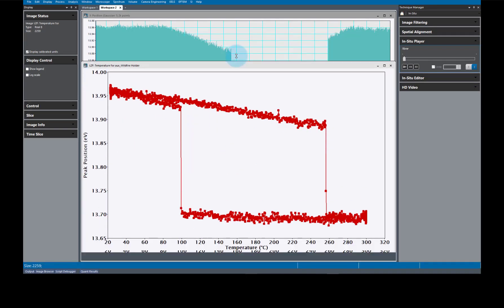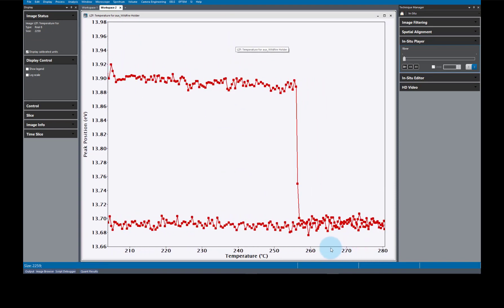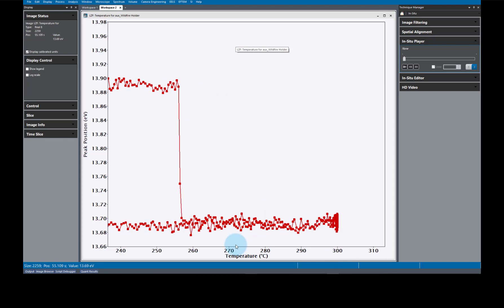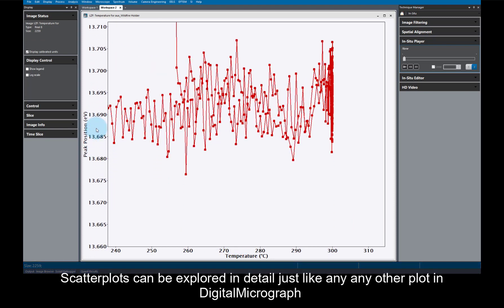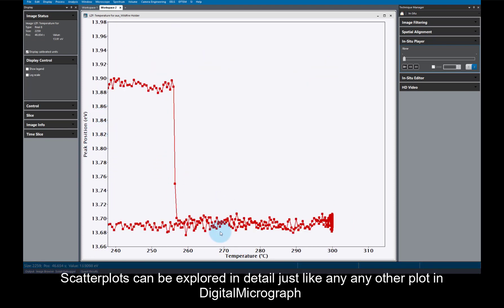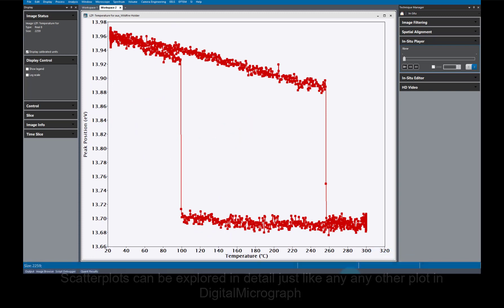After all that, you can have a publication-ready scatter plot in Digital Micrograph. Finally, you can move around the plot and explore in detail just like you can for any other plot in Digital Micrograph. Press the 5 key on the keyboard to return the display to its default extent.